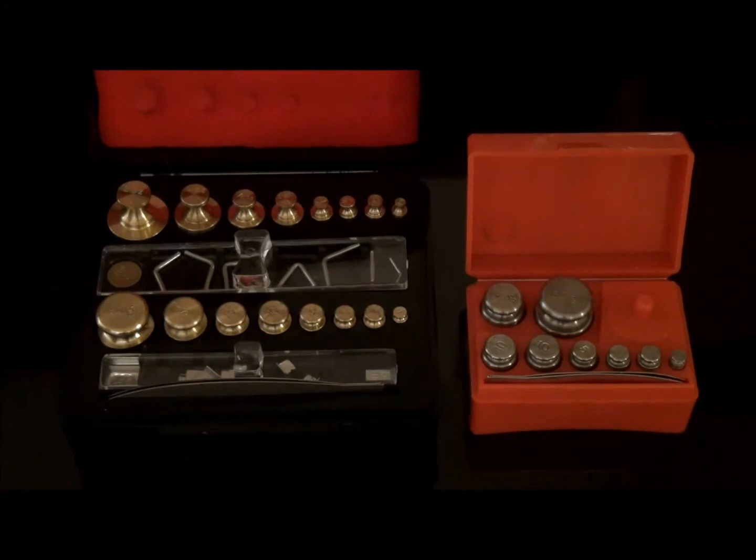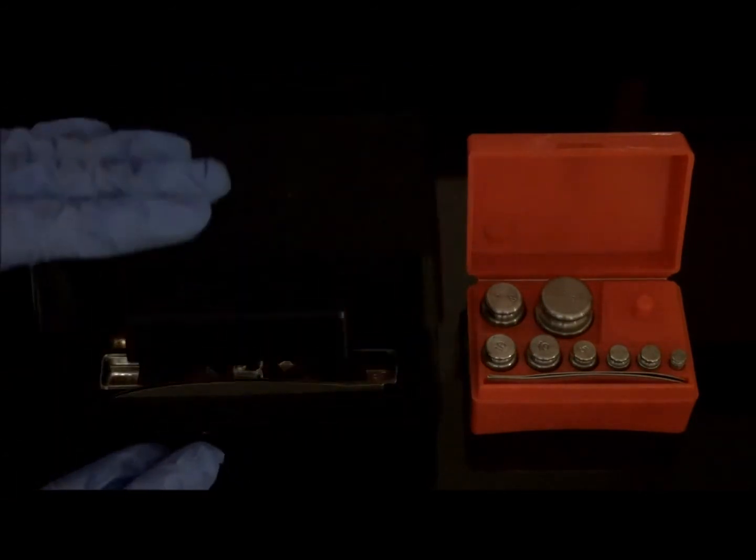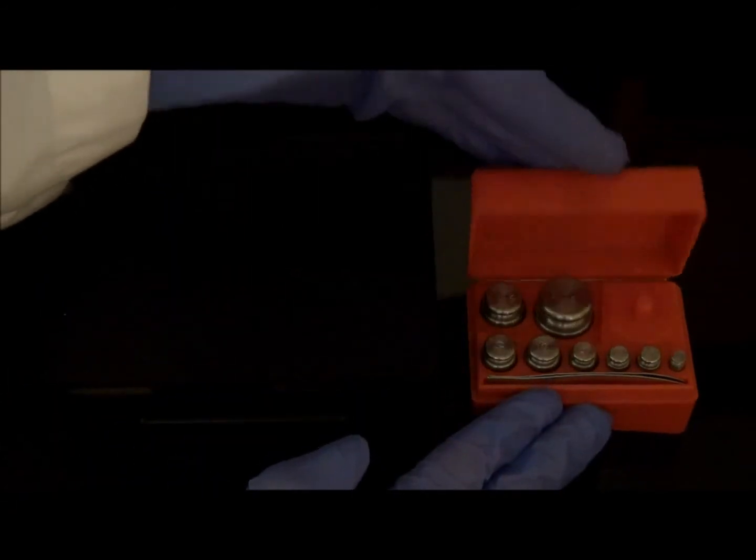Forceps included in more expensive sets of weights are tipped with bone, ivory, or plastic to prevent weights from wearing away with handling. When the weight set is not being used, it should be stored in its original packaging in order to prevent accumulation of foreign matter and corrosion to the surface of the weights, which may affect weighing accuracy. Weights can be maintained for years if cared for appropriately.